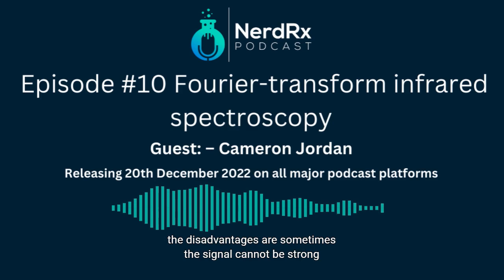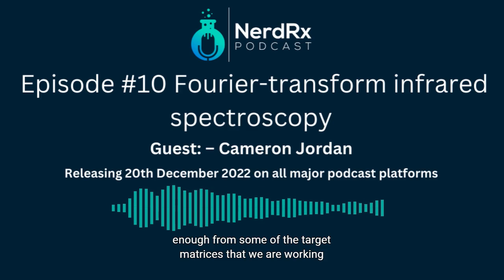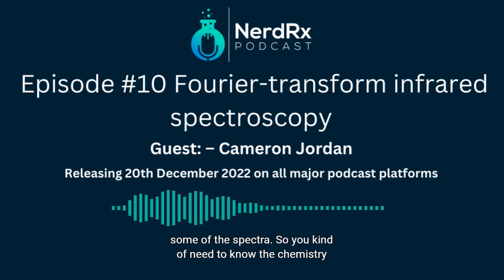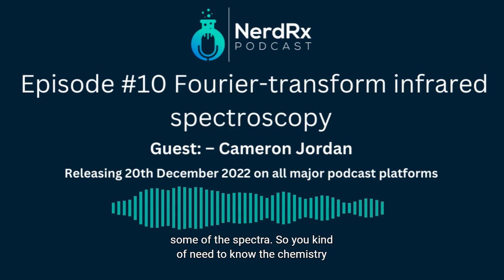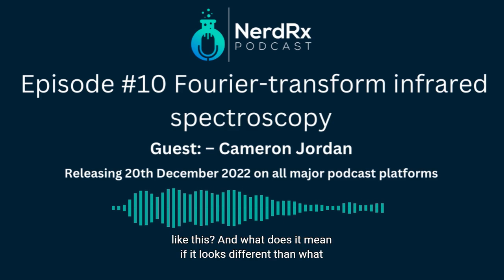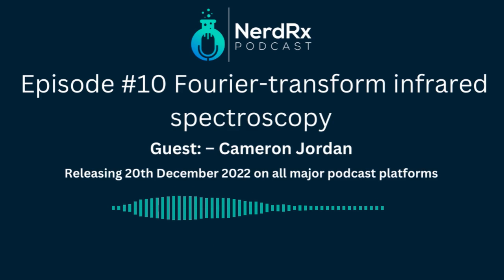I would say the disadvantages are sometimes the signal cannot be strong enough from some of the target matrices that we are working with. And there can also be a lot of noise introduced into some of the spectra. So you kind of need to know the chemistry behind why your spectra look like this. Should it look like this? And what does it mean if it looks different than what you expected?